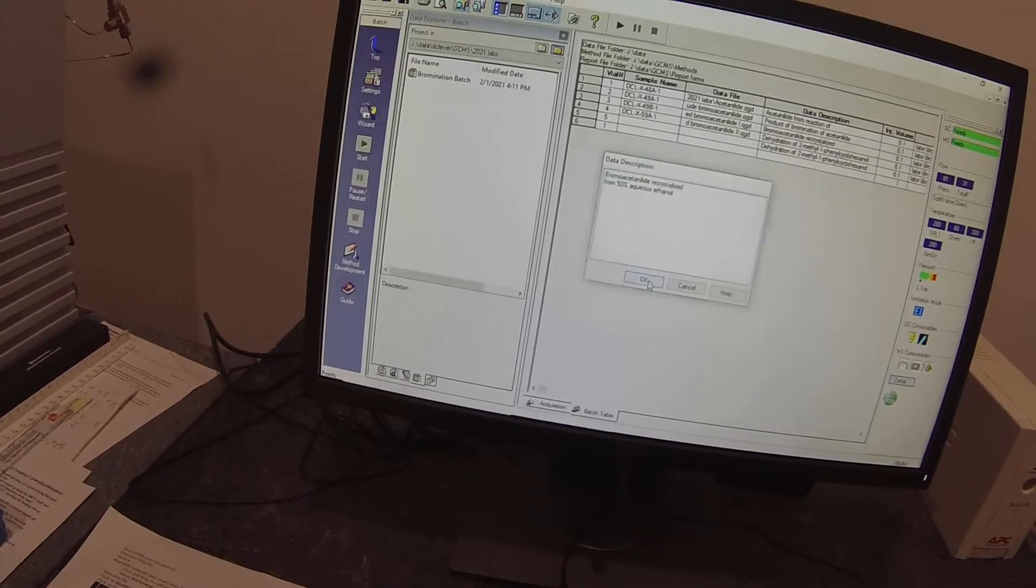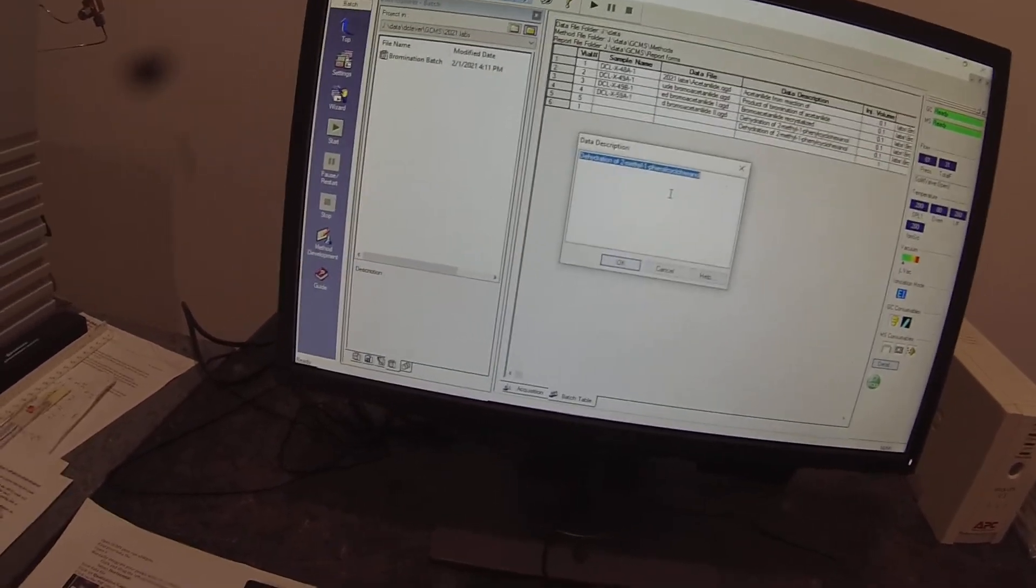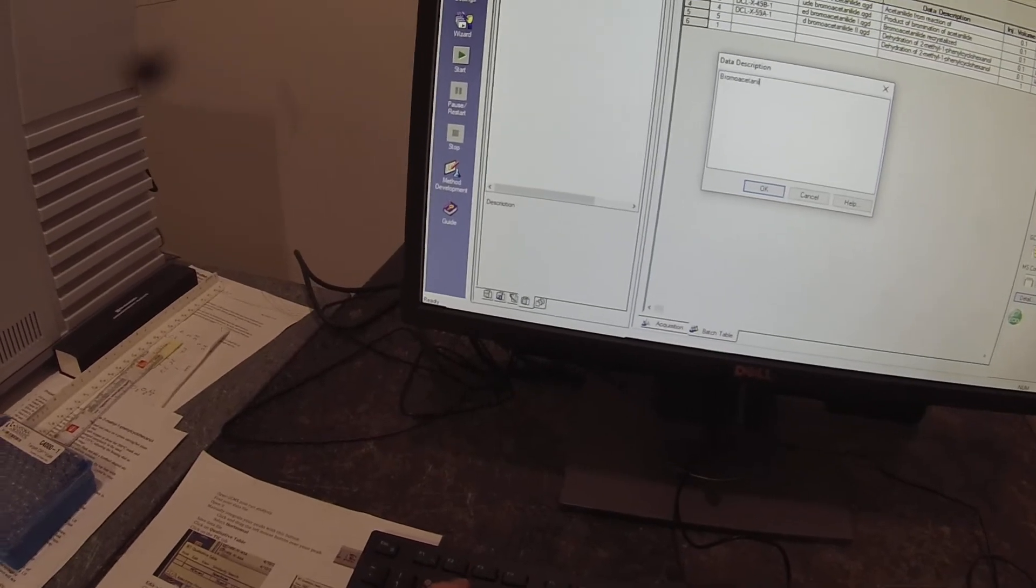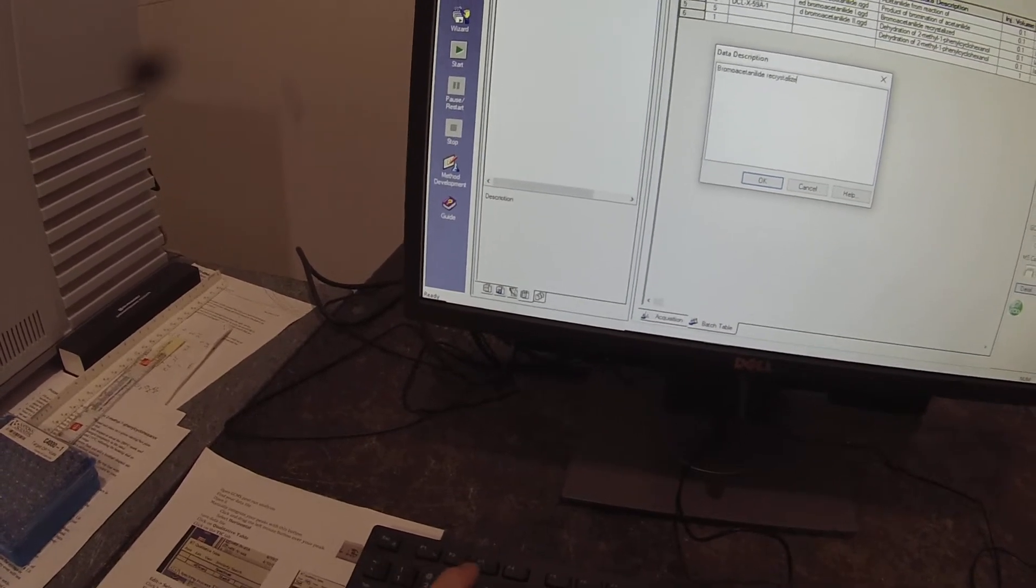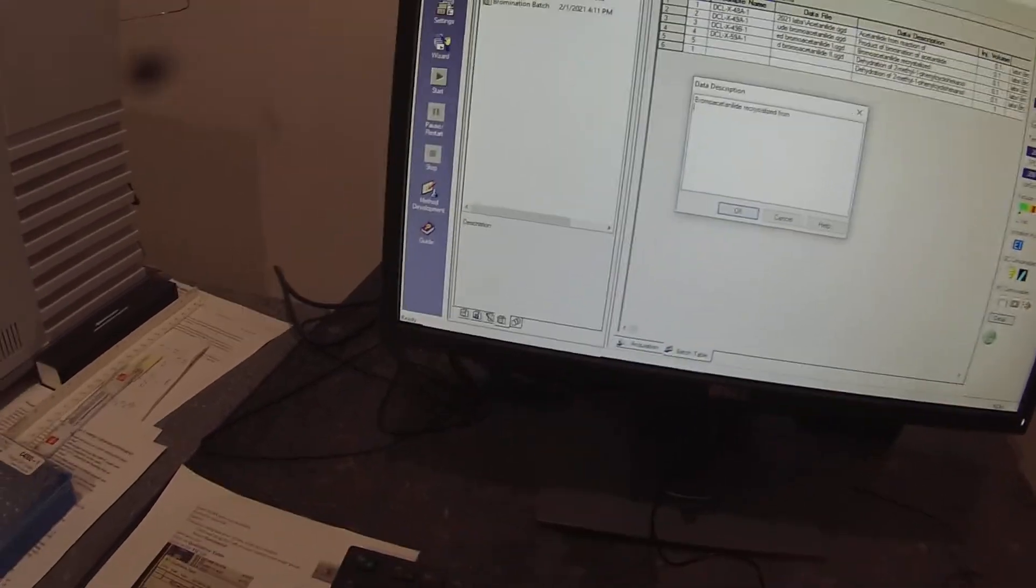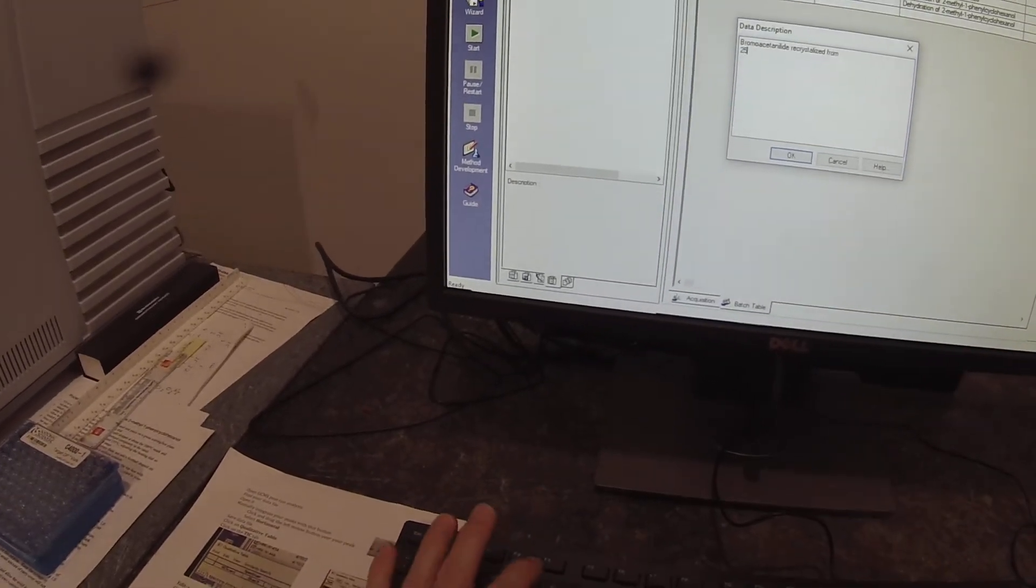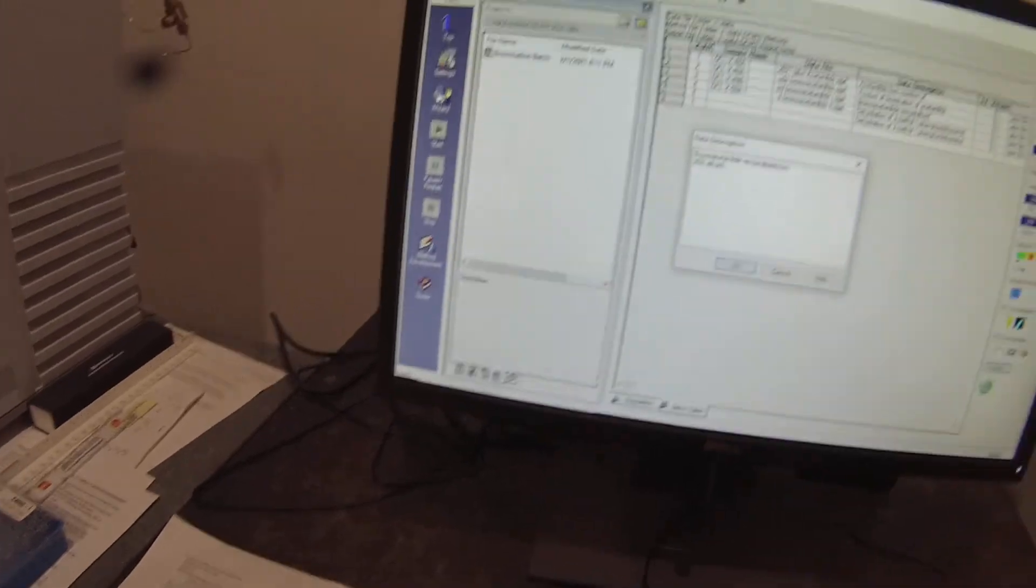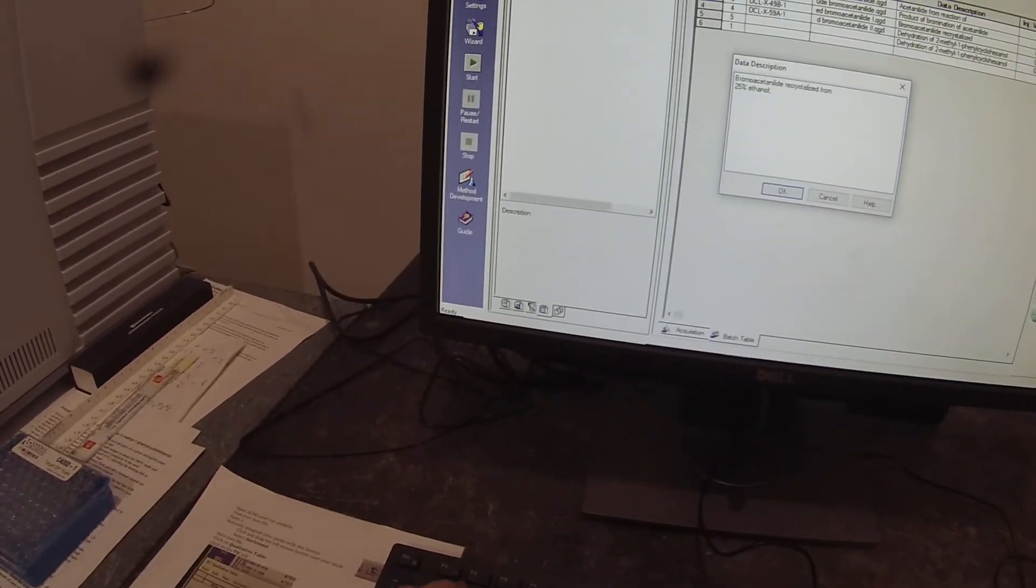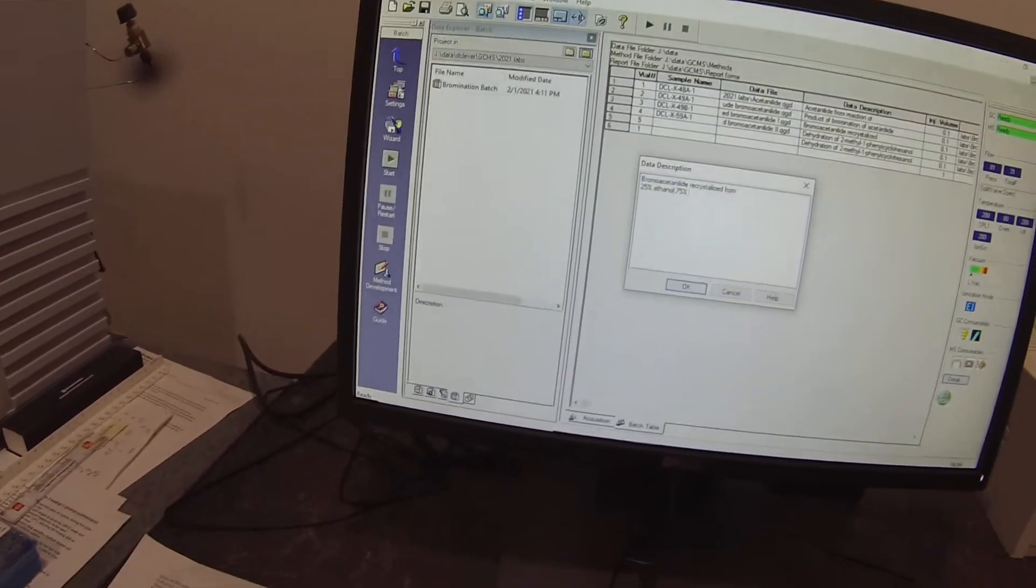And this other sample is bromoacetanilid recrystallized from 25% ethanol 75% water.